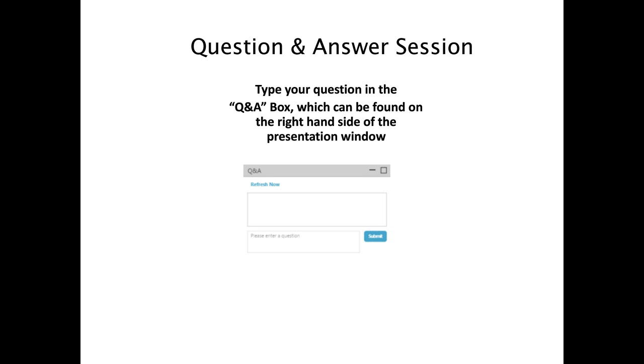How will I know that the Halo column I choose to shorten or speed up a method with will work with my instrument's pressure limit? Oh, that's a good question. So what you can do is estimate the back pressure from your Halo column by calculation if you know the flow rate, the column porosity, the temperature, the mobile phase viscosity, and the column permeability. So there are tables of mobile phase viscosity depending on the temperature, and those parameters aren't too hard to get.